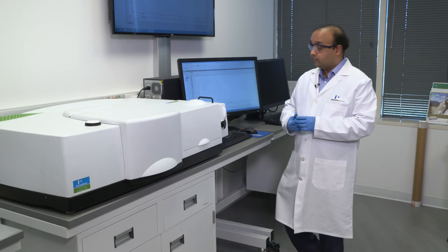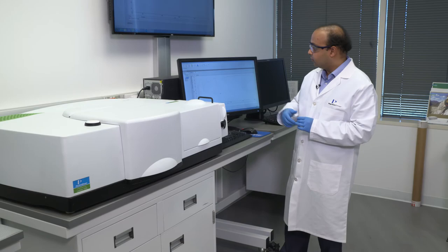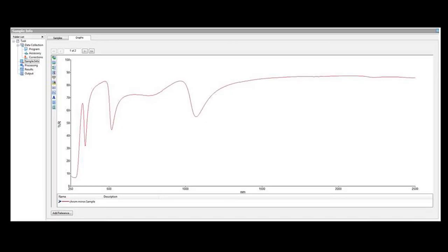To show what the data from this instrument looks like, this is a specialty chrome mirror that I have analyzed here for total reflectance measurements. It starts from 2500 nanometers in the near infrared range, and then as we get into the visible and the UV range, there are some distinct spectral features that are shown in the graph here.